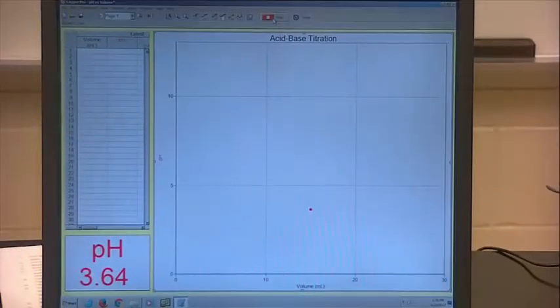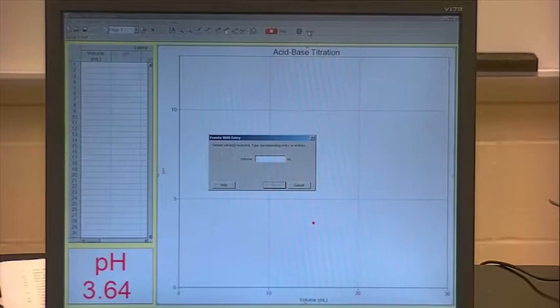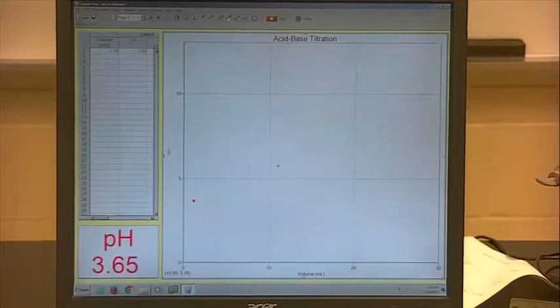So let's go back to the computer. I just added 1.19 mils, so I'm going to click on the keep button. It asks me for the volume. The volume is 1.19 mils, so I'm going to add it. And I hit enter or click OK. And there's my first point. Now, let's add our second 1 mil.